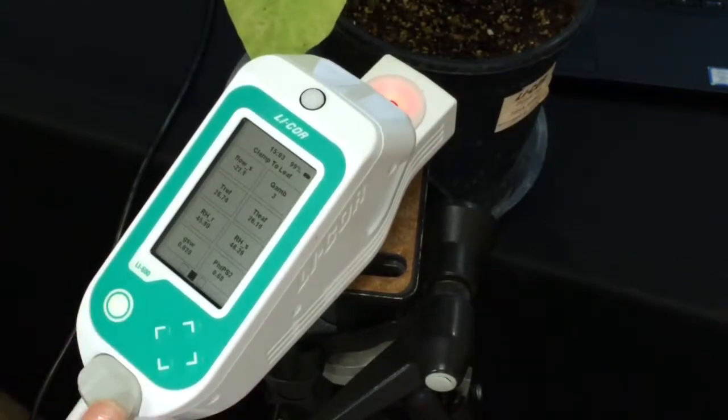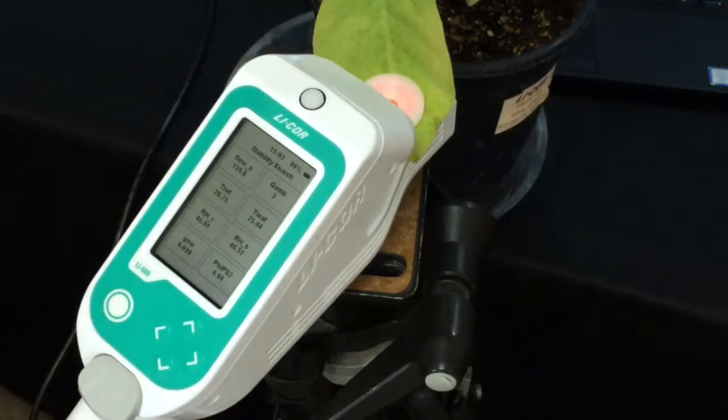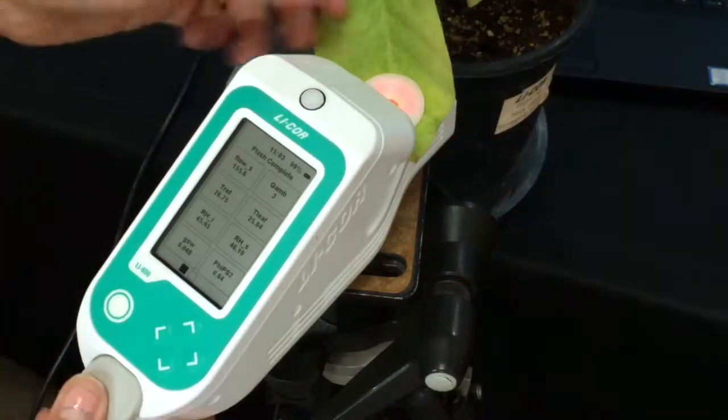Go back, select a new leaf. And we're still within that same treatment, so we're just going to clamp onto that next leaf. We don't have to scan the barcode again. It's going to look for stability, make a measurement, and unclamp.